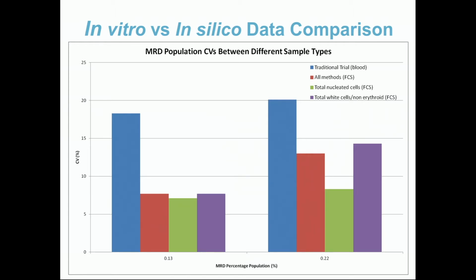And interestingly, we've got higher error. What this is suggesting to me is that the gates should be purifying and making things cleaner, but it's actually making problems for the cells, presumably because of gate placement and then the underlying logic causing issues, I would imagine.